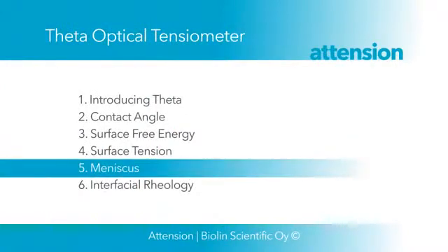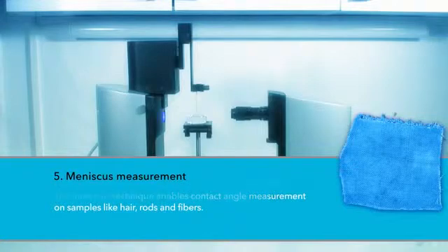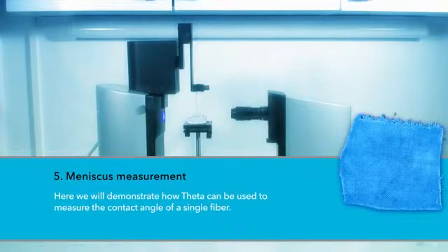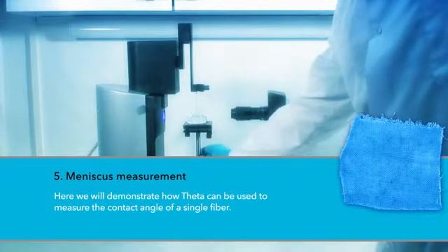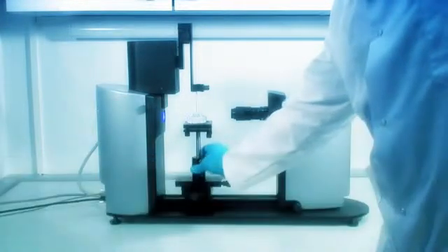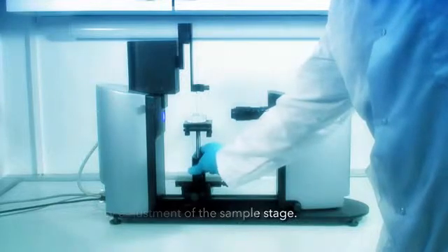Theta can also perform meniscus measurements. The meniscus technique enables contact angle measurement on samples like hair, rods, and fibers. Here we will demonstrate how Theta can be used to measure the contact angle of a single fiber. The fiber and the liquid sample vessel are put in place.